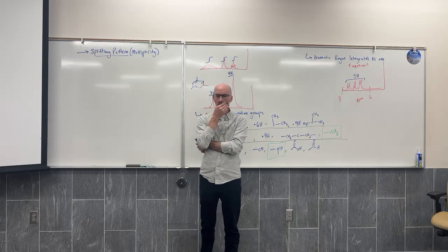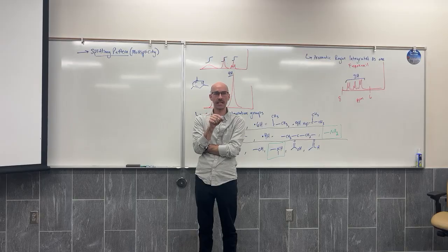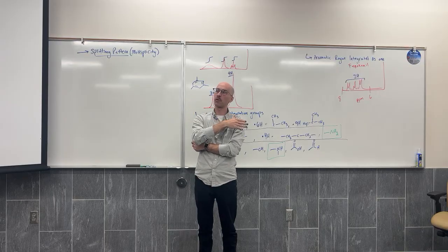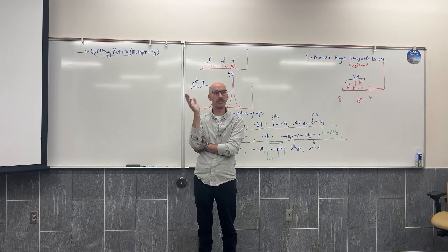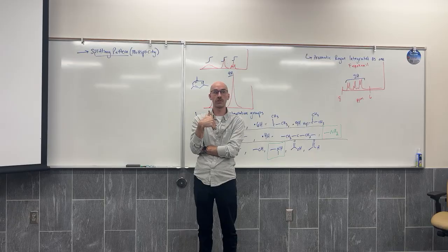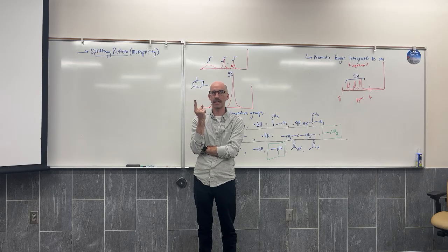When you analyze a proton NMR spectrum, 99% of the nuclei are NMR active. 99% are H1, and the other 1% is deuterium, H2. So when you analyze a sample, you're getting 99% of the sample to respond, and you get a very clear signal. But somehow these nuclei communicate about their spins with each other.